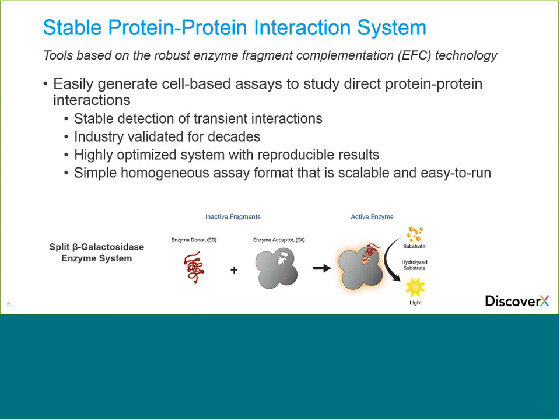So we'll use this vector and introduce your target protein of interest, the GPCR, and fuse it with the small donor or ProLink tag. The 4 different tags available are listed in the table below, but the first one is by far the most common.